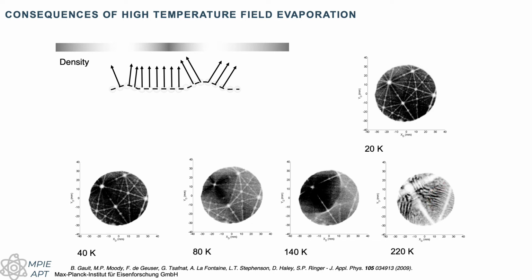Again, the specimen's shape depends on the temperature, so the experimental conditions. And we're going to build different radii over the cross-section of the specimen, where some set of atomic planes are sitting. And this can be explained because the work function and the bonding, the packing of the different sets of planes is simply different.